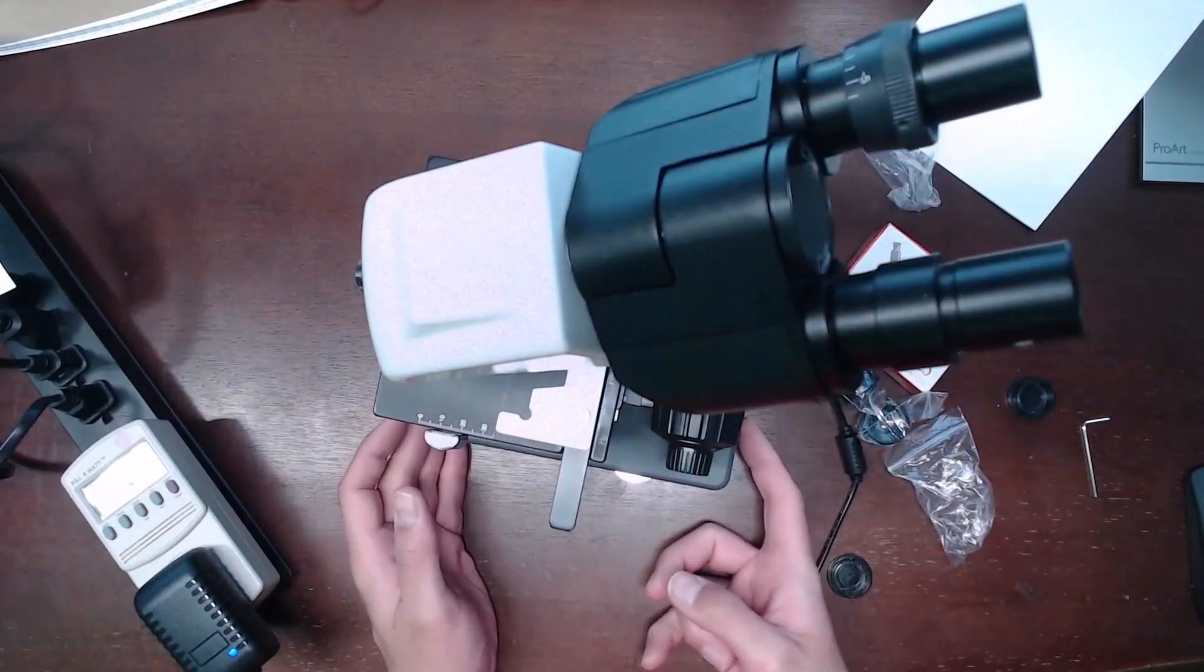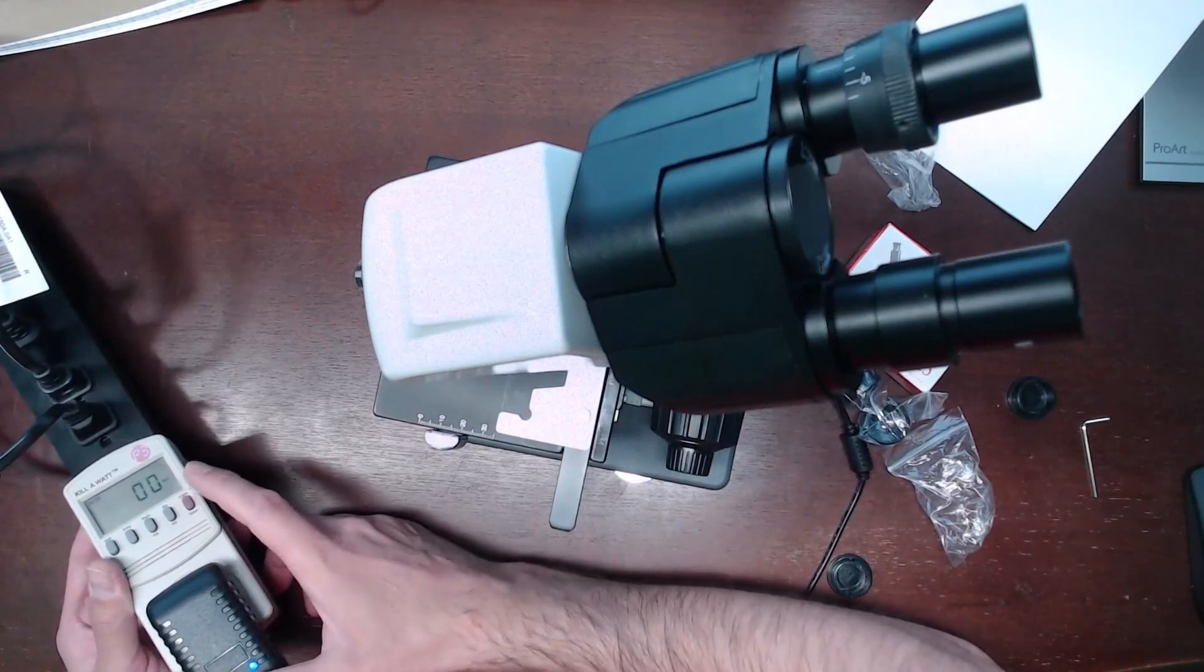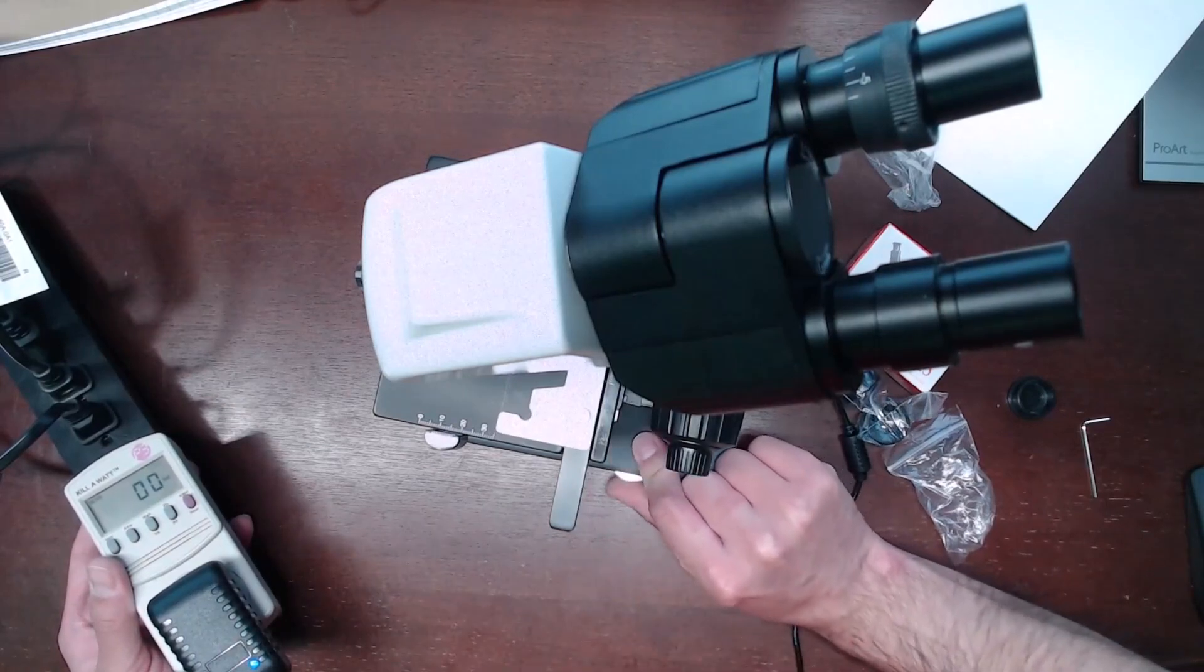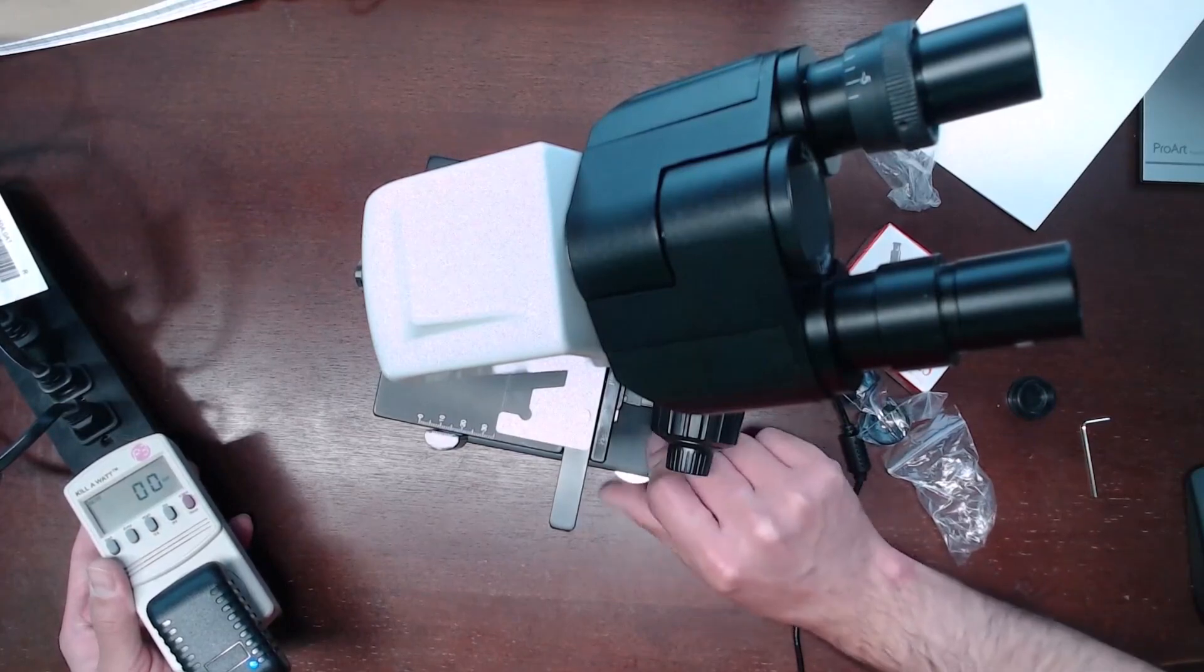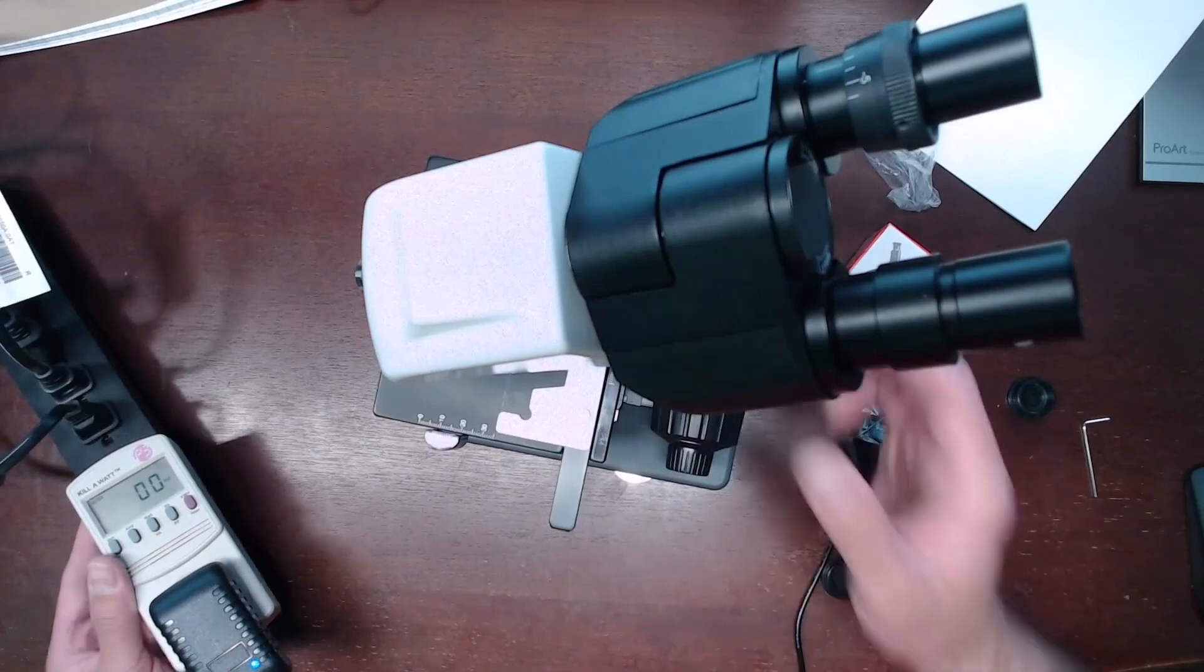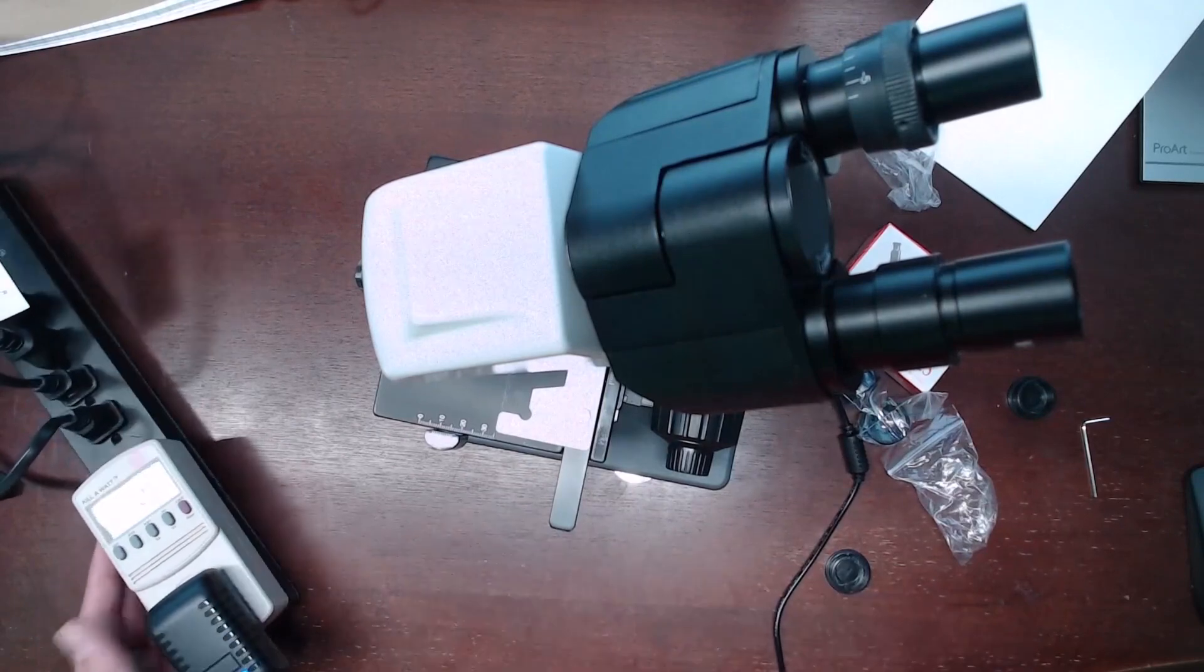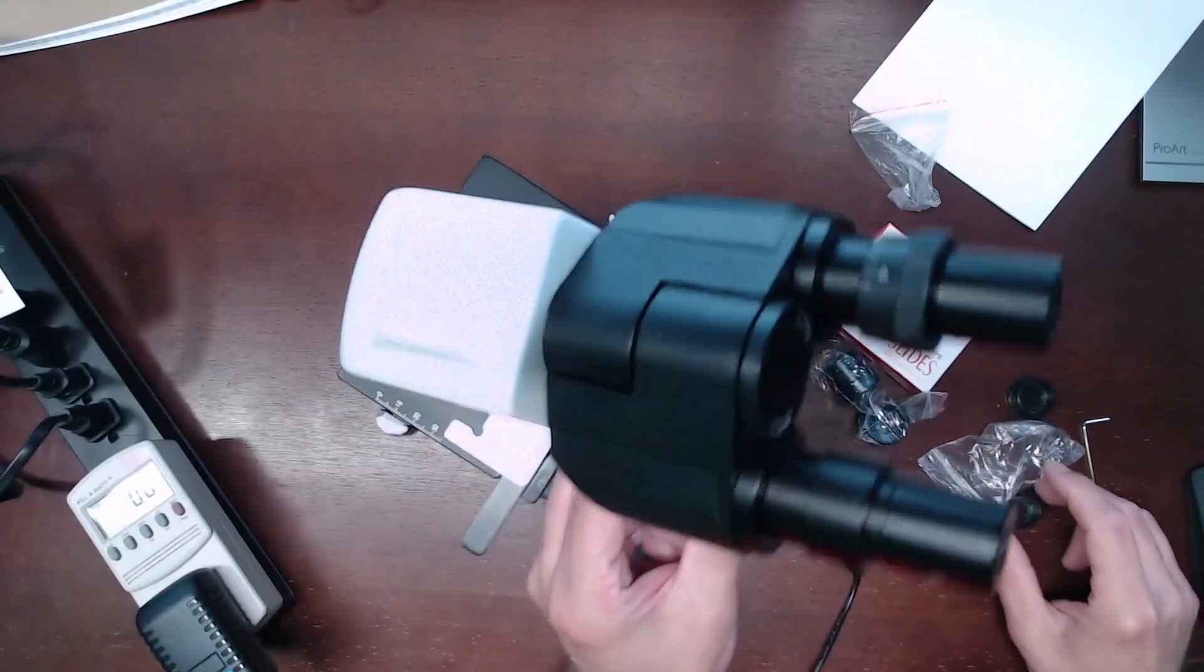We'll go ahead and turn this on now actually. And you'll see the power draw stays at zero almost constantly. Every once in a while you'll see it jump up to three watts for just a moment. The included light is the only power draw that is happening from the microscope. I believe the light is rated at one watt. But even when you open it up full brightness, it's a negligible amount of power. And right now this is cranked up all the way and we're seeing no power draw. But if you keep an eye on it every once in a while it'll jump up to three watts. The power draw is very minimal.